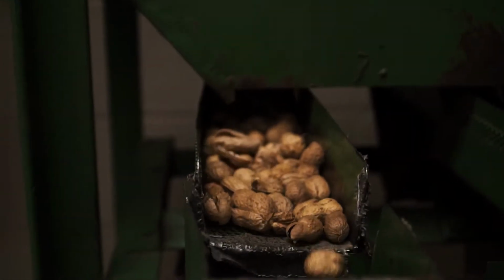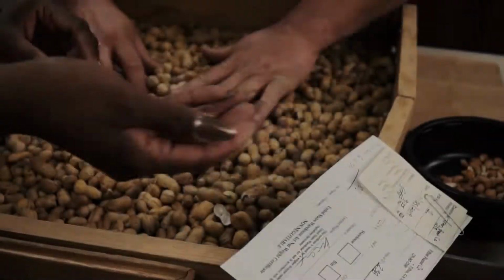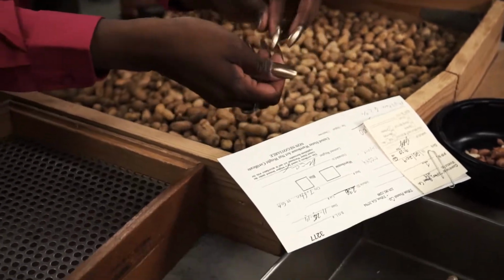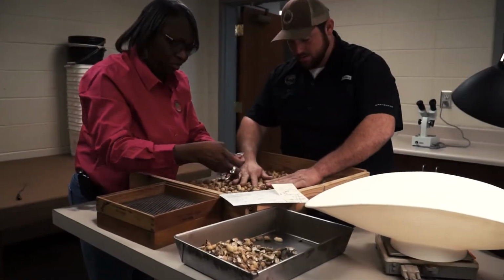Loose-shelled kernels, also known as LSKs, are peanut kernels or any portions of kernels completely free from hulls. These are undesirable, since kernels generally store better if they are inside of completely sound hulls. The machine does most of the work. However, the inspector completes the sorting by hand.